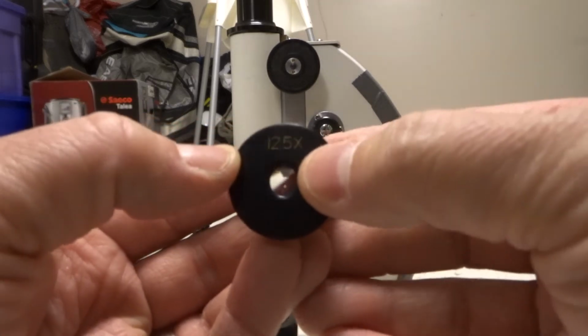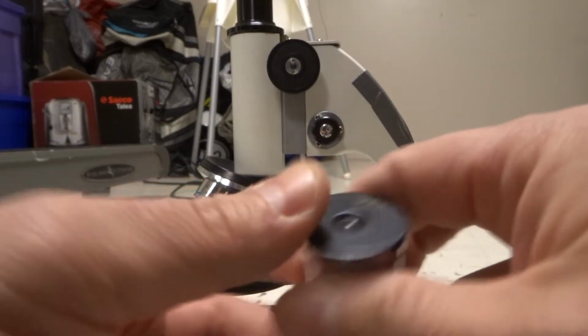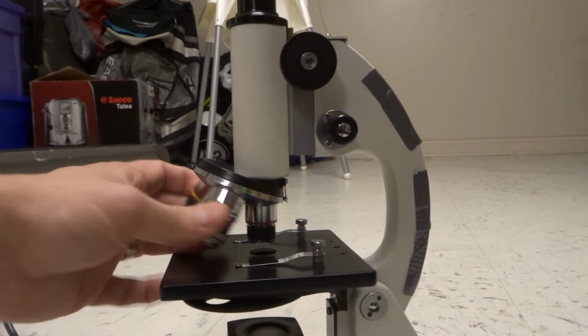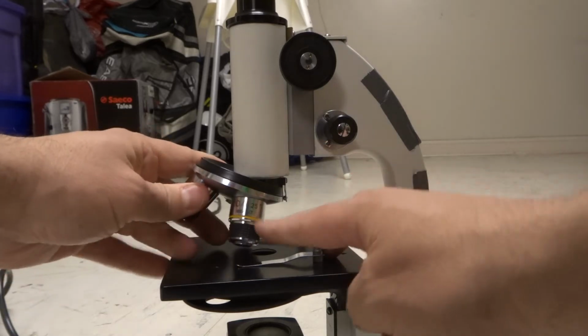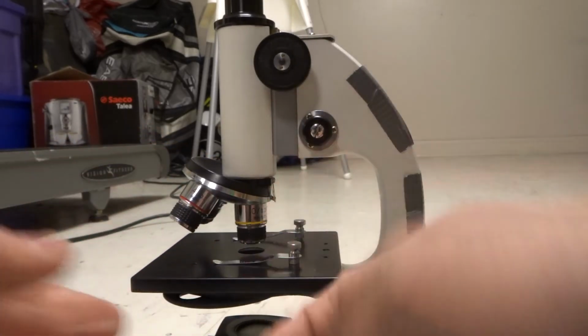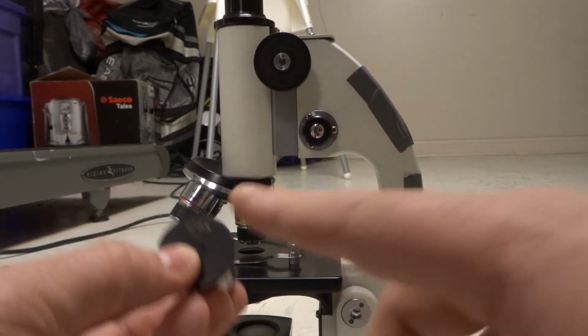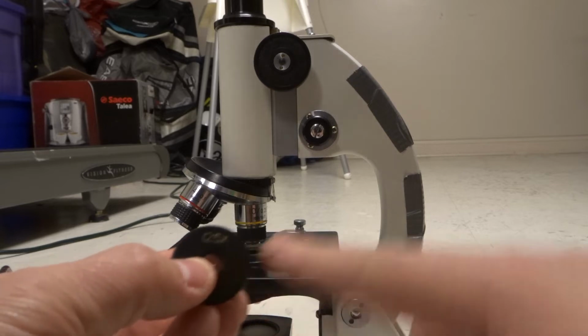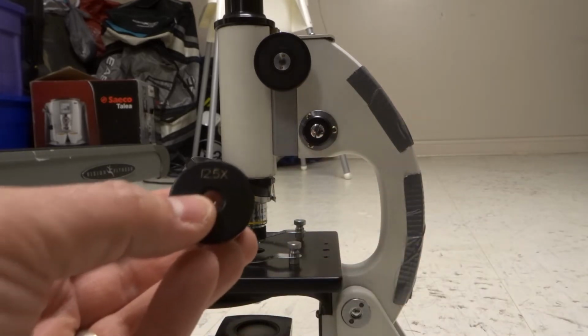So this one right here is a 12.5 times. So you have a 12.5 times magnifier here, and then you also have another magnifier down there. Let's assume that we're going to put on this one right here, which is a 10 times magnifier. Okay, so we have the 10 times magnifier down there, 12.5 times up here. All that you got to do is multiply those two numbers together. So we have 12.5 times 10, which gives us, as long as we move the decimal over, an answer of 125.